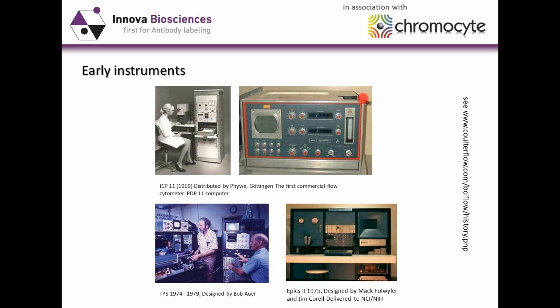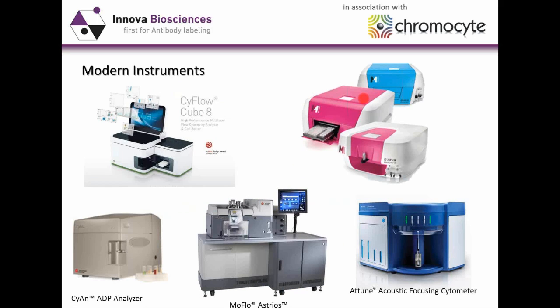And they also could really only look at 2 or 3 parameters, 3 colors at the maximum. Clearly things have moved on since those days, and we're now blessed with a large profile of instruments provided by a number of different suppliers, such as we have listed here.